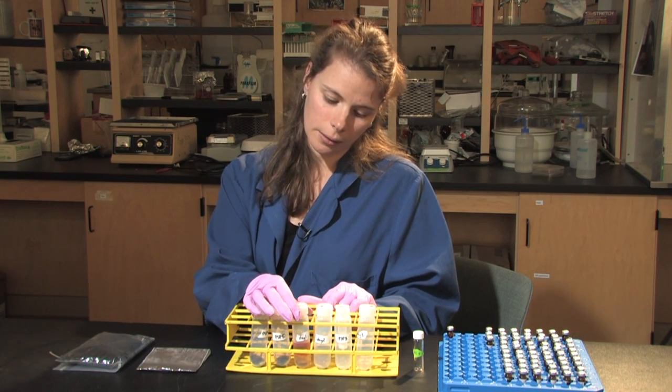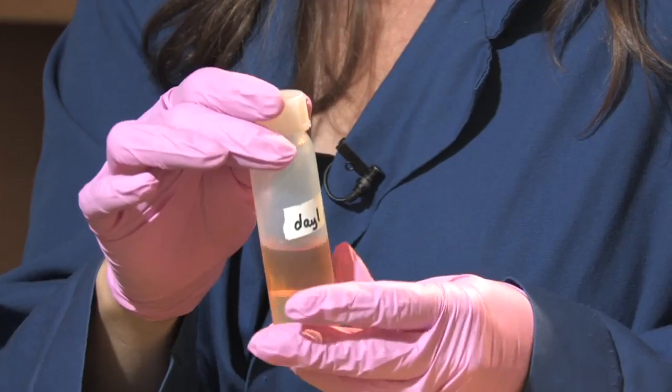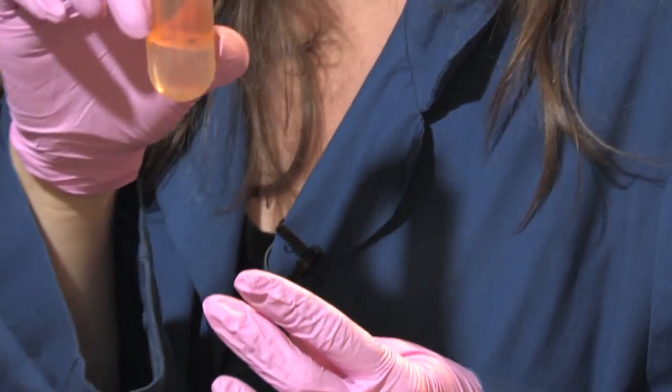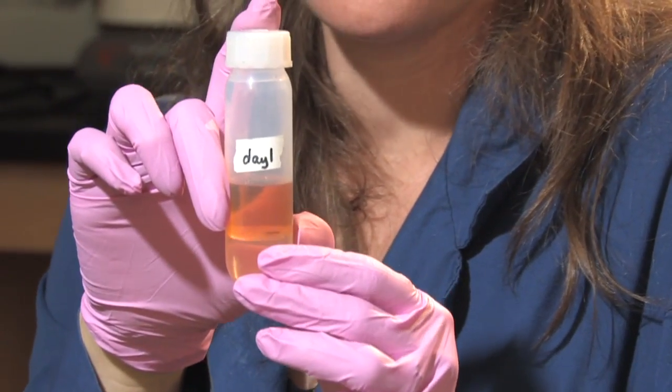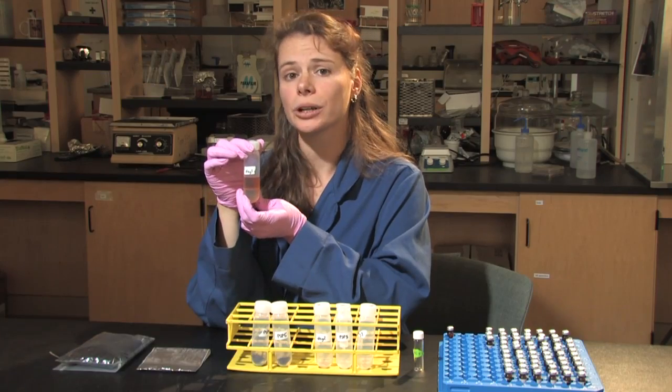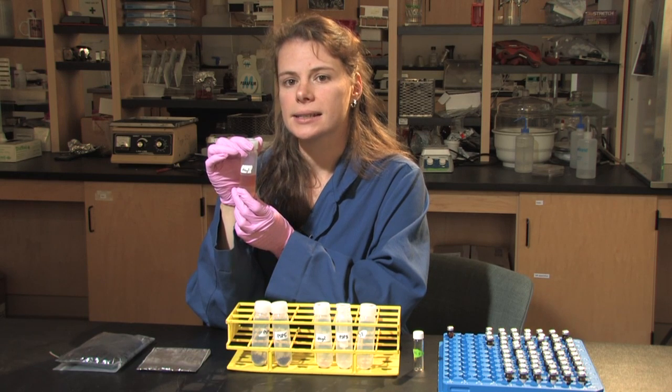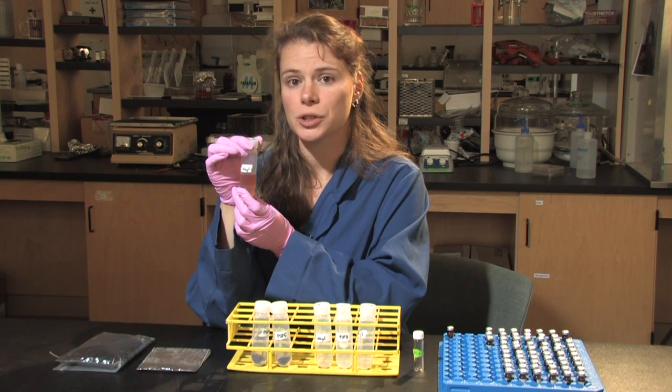The soil is then put onto a shaker and spun on a centrifuge afterwards. We are then left with the supernatant — basically the liquid inside the tube, excluding the soil. From here, I add more chloroform and citrate buffer and let the sample sit overnight. This first day takes about five or six hours for 24 samples.